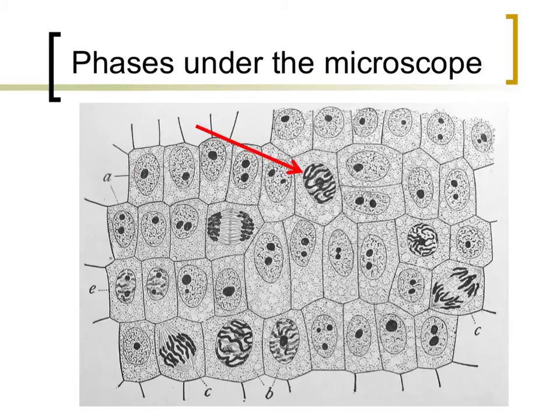During prophase, the first stage of mitosis, individual chromosomes can be identified since DNA has become condensed. What can be seen is that they are still contained within the spherical nucleus as the nuclear envelope has not yet dissolved.